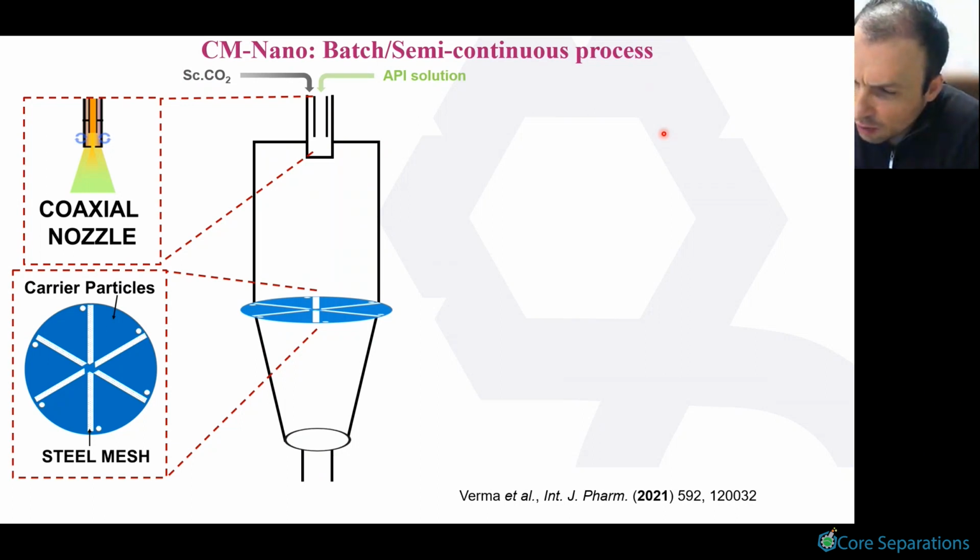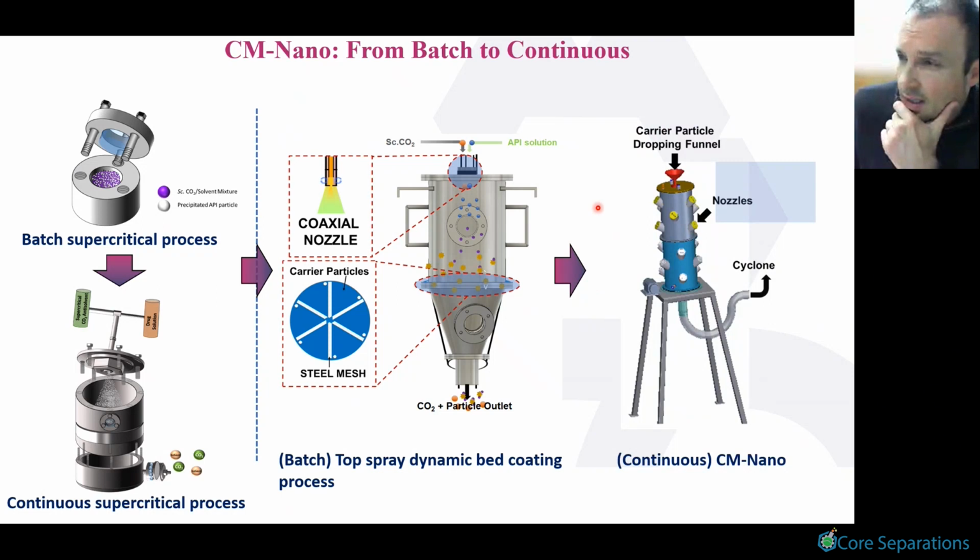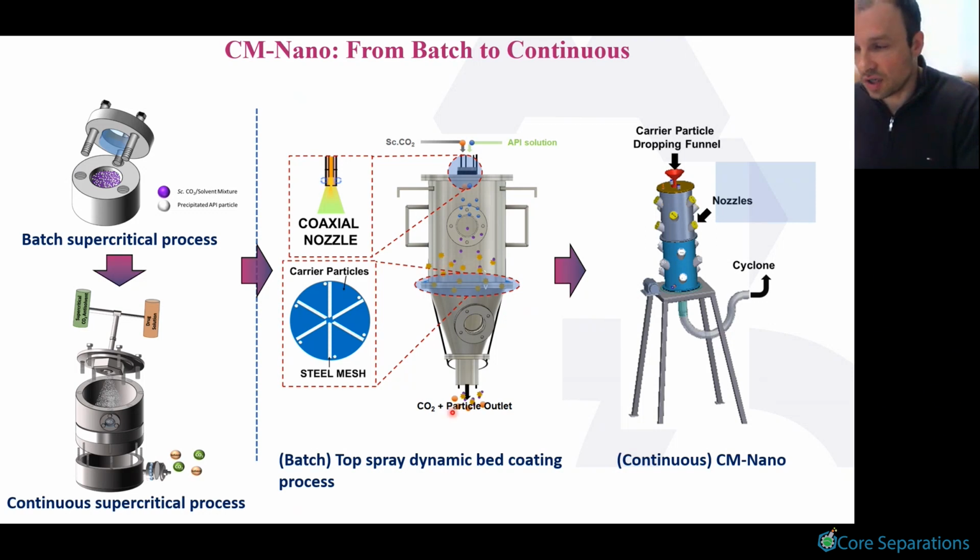Yeah. So I suppose each of these technologies will have advantages and disadvantages. The disadvantage here when we're using this semi-continuous process is that there's only so much you can put on top of this mesh in terms of the amount of excipient particles. That typically is 20 grams, 30 grams in the size that we're using for our drying chamber. And that allows you to coat your nanoparticles onto the excipient particles until everything is mostly coated, and then you discharge and you insert more particles there. So you cannot put here 1 kilogram, right? There's only a certain amount that you can put there. While over here, you can add significant amounts of excipient particles continuously and get very high yields.